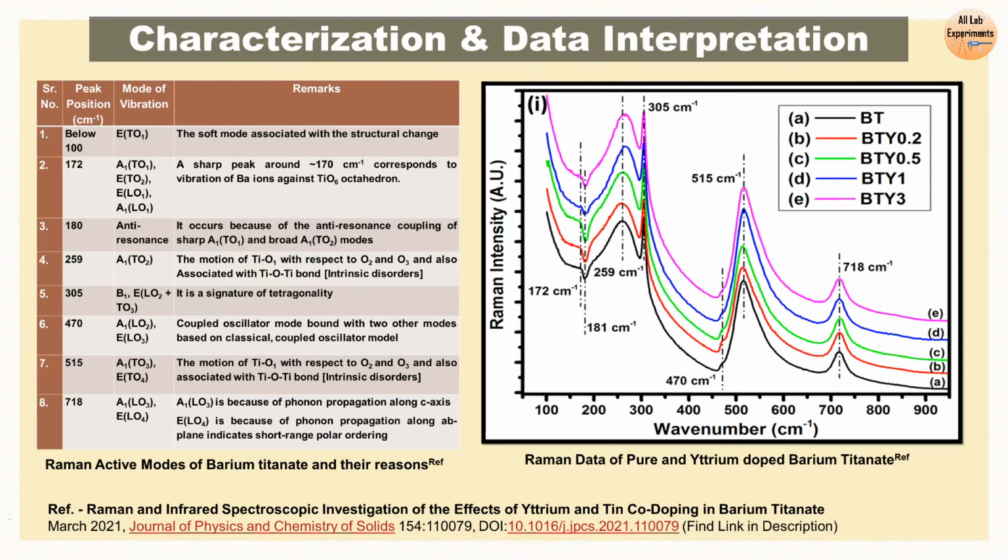But now let's do some comparative study. If you are adding something to your base material, what changes should occur in your Raman data? So I'm broadly mentioning what should happen in your sample when you change something in that structure. But before that, we should understand that the Raman shift corresponds to the energy of the vibrational level. Whenever there is a high change in energy, your Raman shift will be more. In cases when there is a low change in energy, the Raman shift will be lower. In this way, we can understand that energy is directly related with the Raman shift.